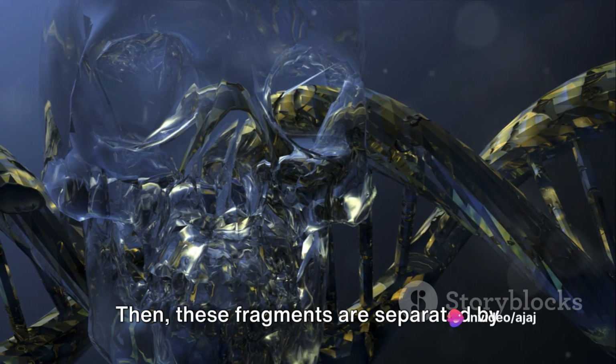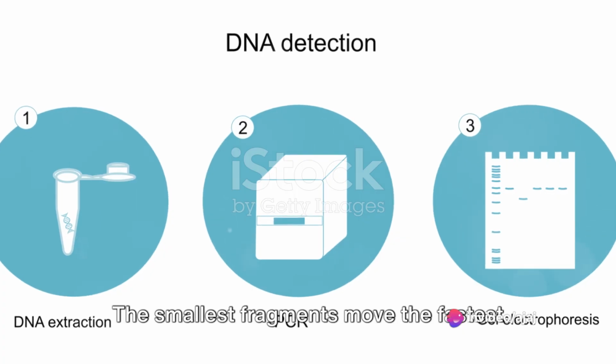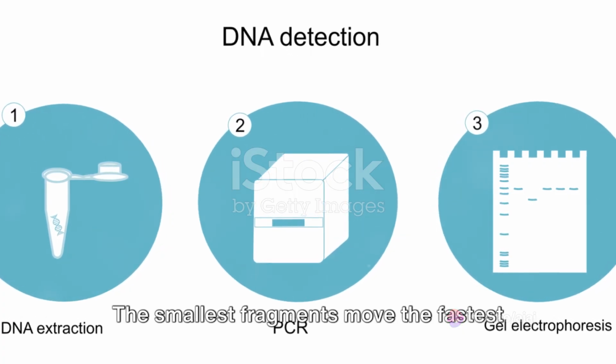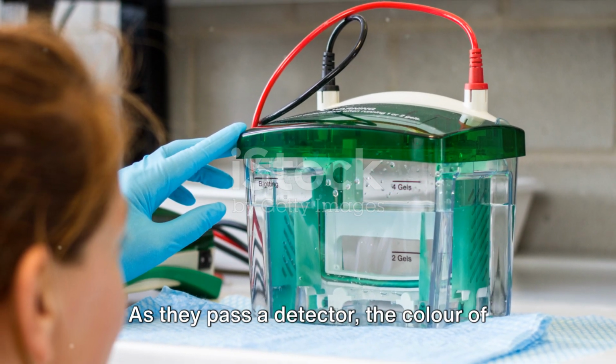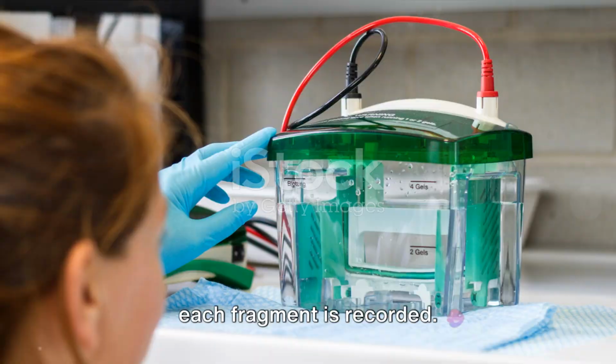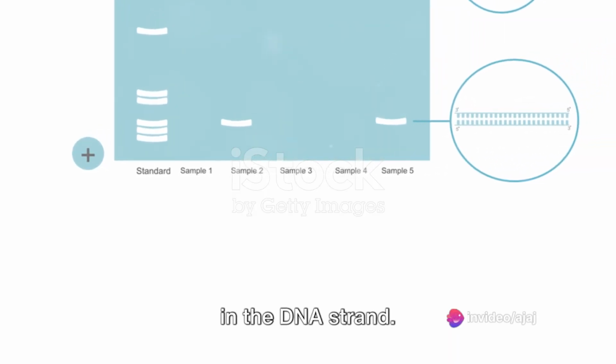Then, these fragments are separated by size using a process called electrophoresis. The smallest fragments move the fastest, and the largest ones move the slowest. As they pass a detector, the color of each fragment is recorded. This gives us the sequence of nucleotides in the DNA strand.